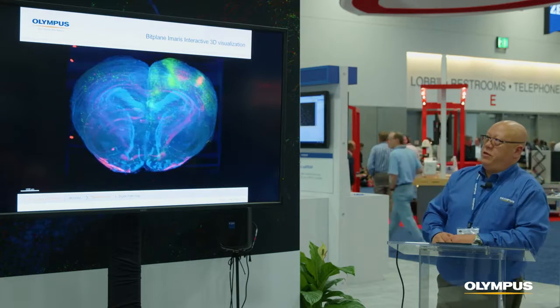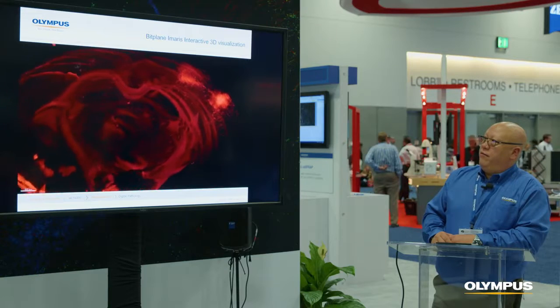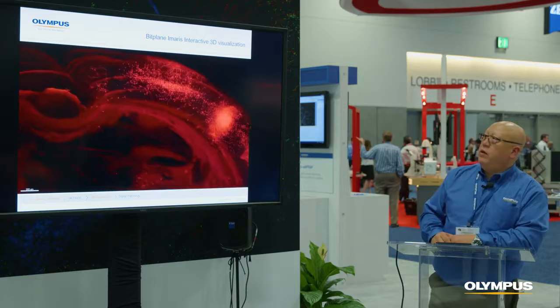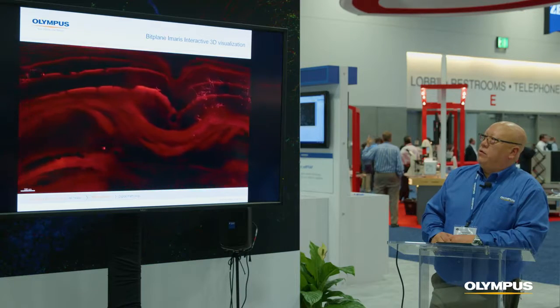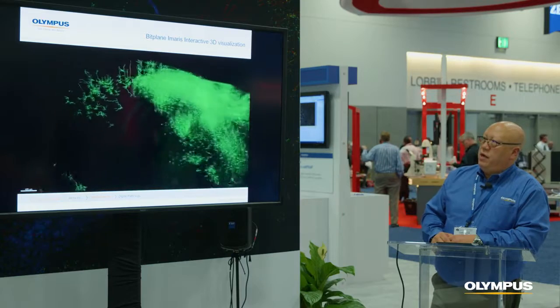So with this visualization, you're able to verify where the activity is happening from the virus injection, and if the virus has actually moved from different parts of the brain or did it stay in the same area. And also we can see with the color coding later on in this visualization, the length of the neurons.